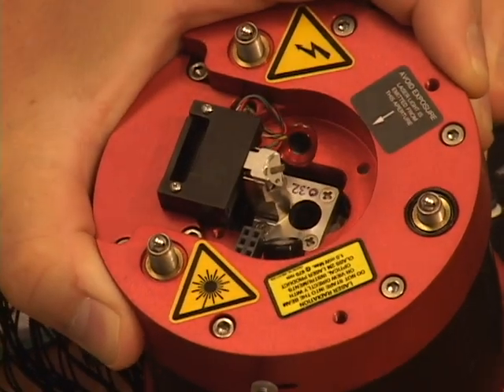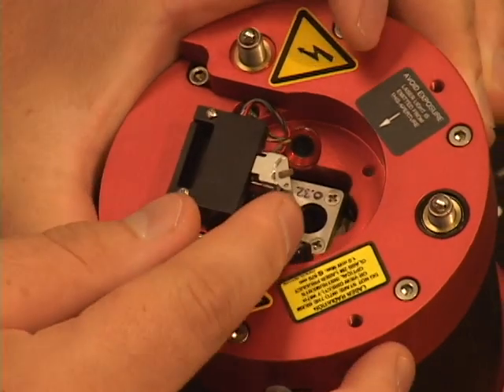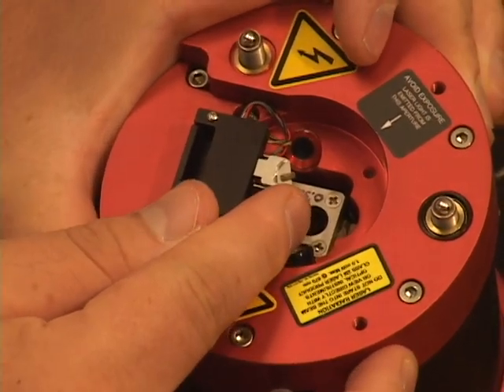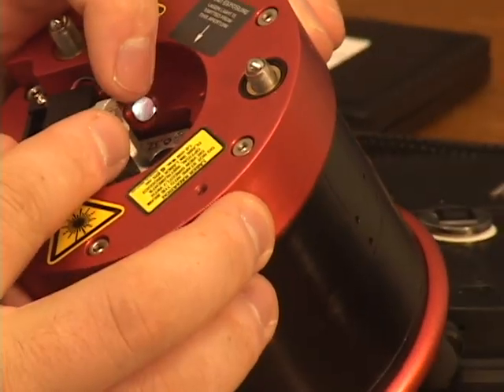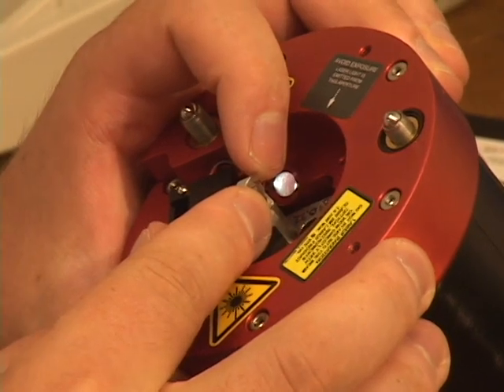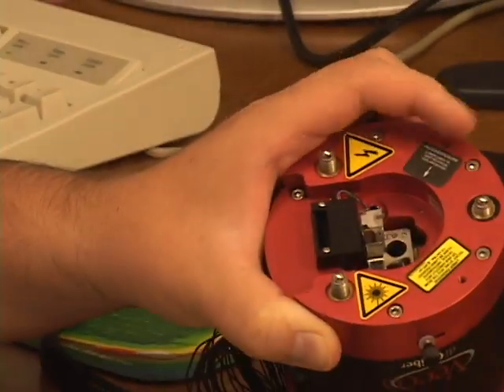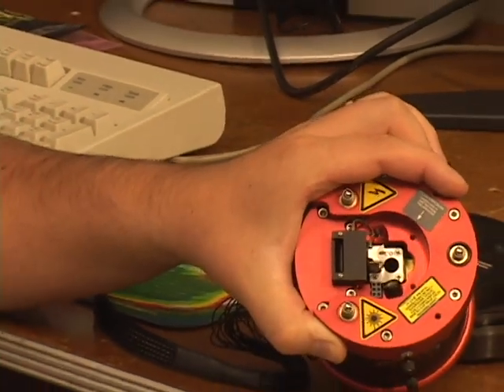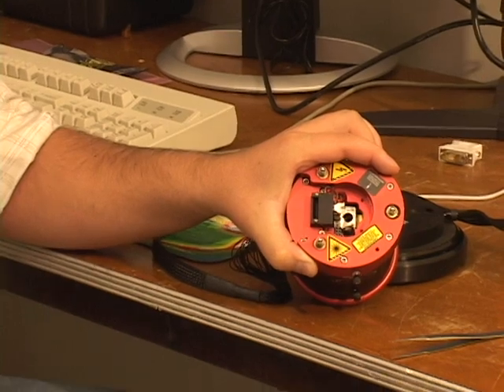After it's held on there, you can either use your tweezers, or if you're really careful enough, just focus on the corners of that half moon to place the probe right in the center. So center it. Make sure it butts up against the back of the scanner. And it should look like that, nicely aligned. Can I get a shot of that nicely aligned?